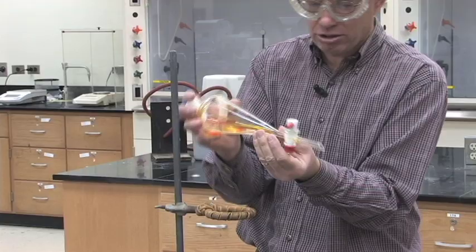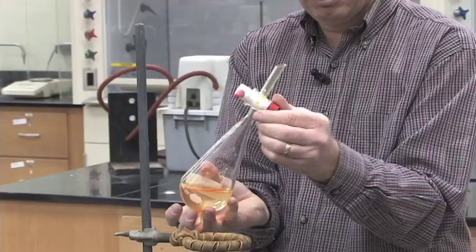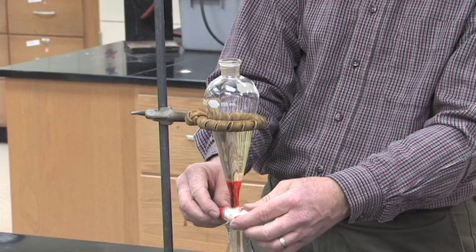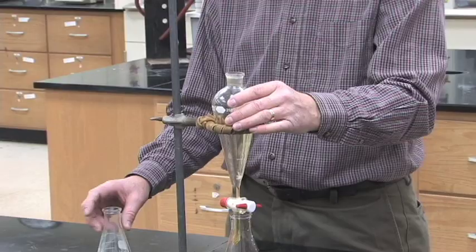Make sure you're not aiming at anybody in the lab when you do that. Gently invert it a few times, vent it, close the stopcock, stick it back in your ring stand, take the stopper out, and then you're ready to drain the bottom layer out the bottom.